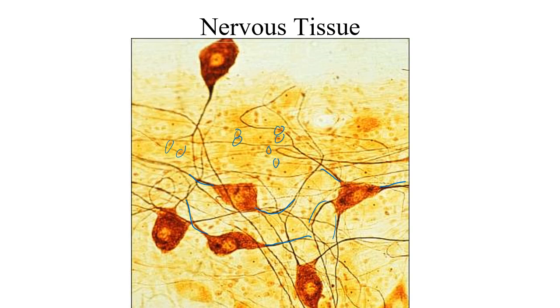So remember to be able to identify the name of the tissue, where you can find it, so what its location is, and then from there be able to also name some of the specific things that I pointed out on each of the cells as well. And then all of the content that comes from the first 2 exercises will be on there also.